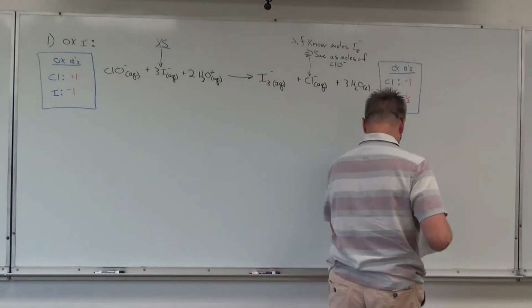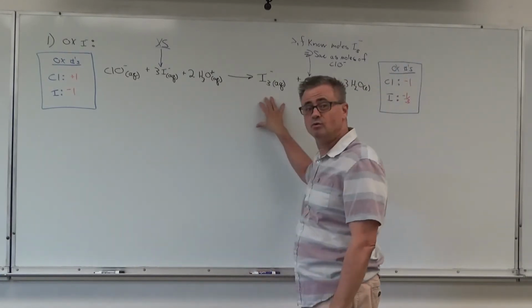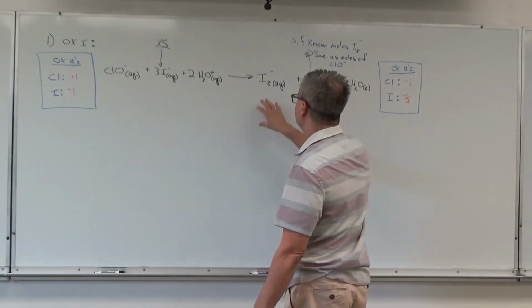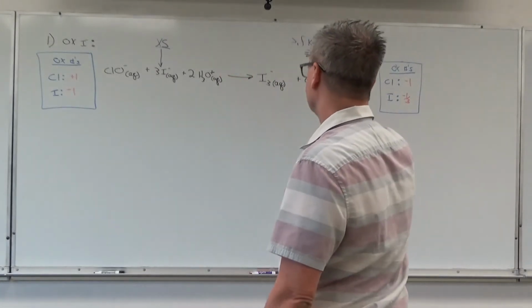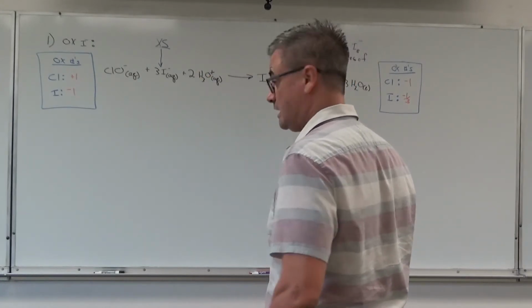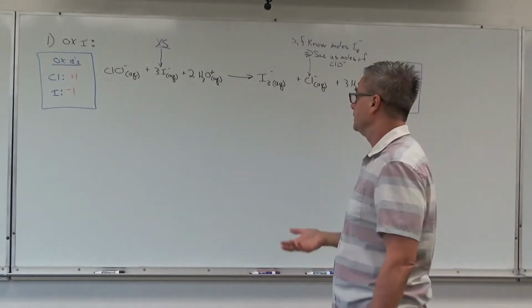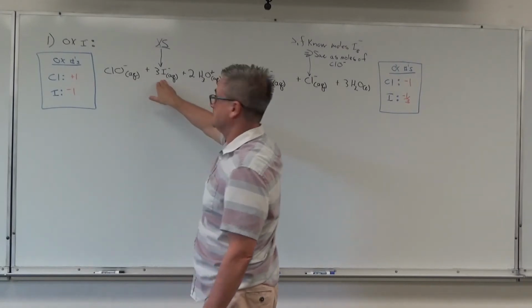As I said, the solution will turn brown a little bit, but there's no real good way to tell. It turns brown early on in the reaction, and then becomes more and more brown. There's no way to know by monitoring that color when you've completely consumed the bleach. If there was, we could put the potassium iodide in our burette. But experimentally, we're just going to put this into an Erlenmeyer flask and add the excess potassium iodide.